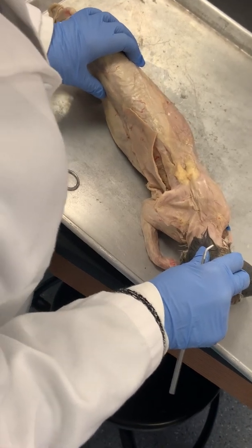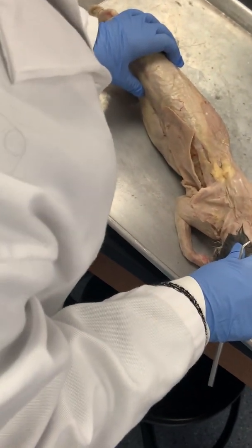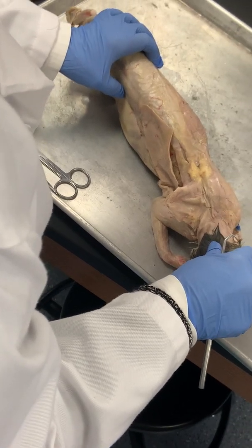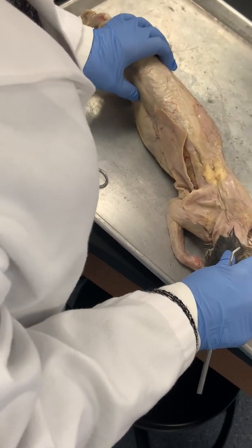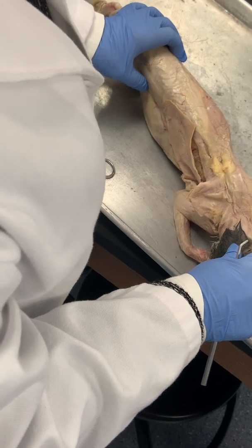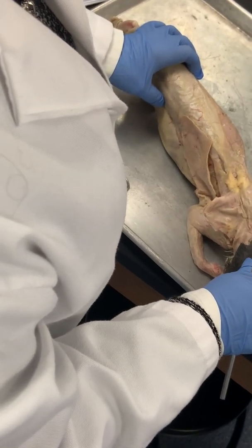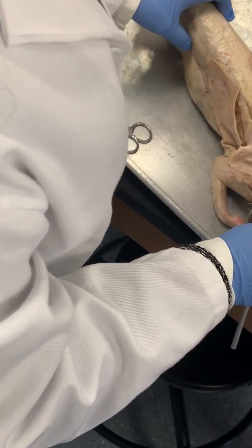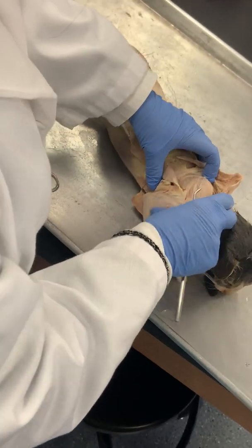Which is the one that depresses your scapula? The rhomboids retract. When I'm standing at attention and I go like this — yeah, that's protraction, this is retraction. There's something on that sheet that said depresses the scapula — that depresses the ribs. Okay, anyway, then if we look here.